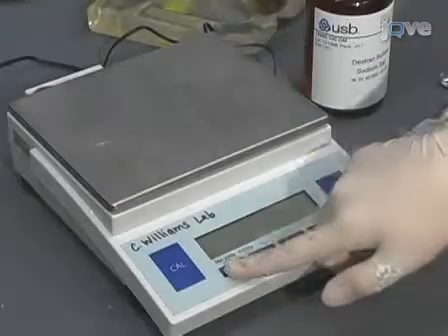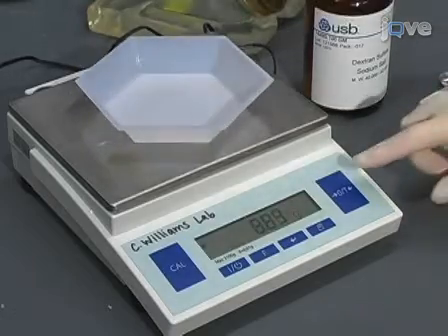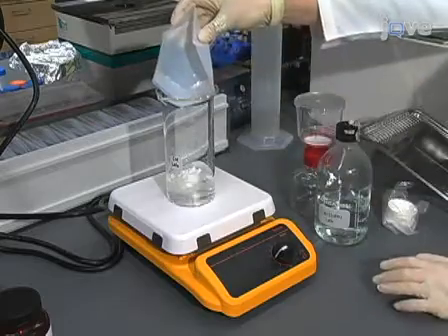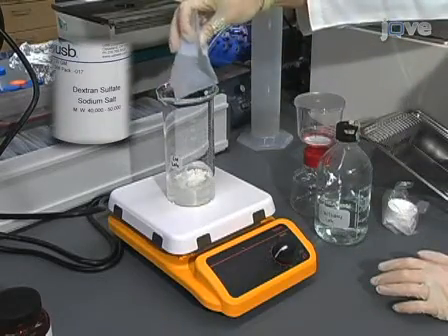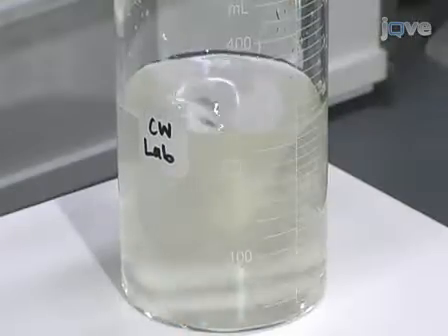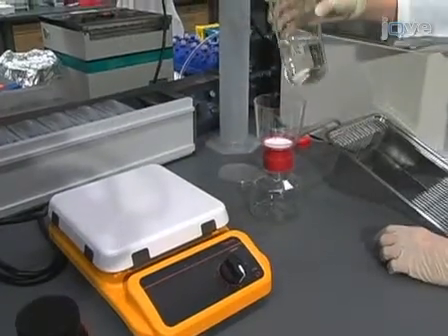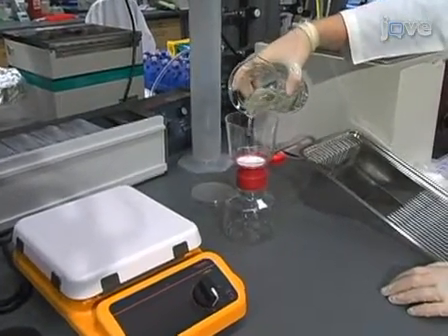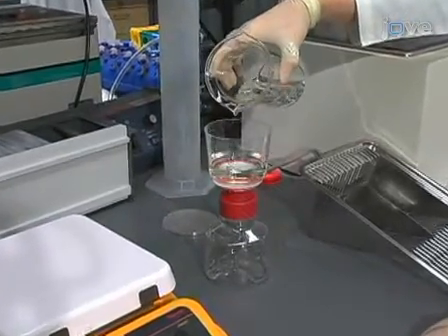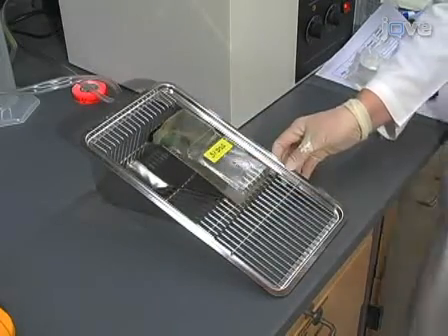Prior to beginning dextran sulfate sodium treatment, baseline weights are obtained. Throughout the course of the experiment, daily weights are taken. Make a 3% weight per volume dextran sulfate sodium salt solution, or DSS, in water. The DSS must be of a low molecular weight for this model to be effective. Make enough DSS solution to fill a water bottle for each cage of mice and filter the solution with a 0.45 micrometer cellulose acetate filter. Replace the drinking water bottle in the mouse cage with a bottle containing 3% DSS solution.